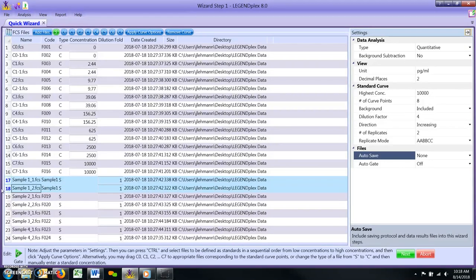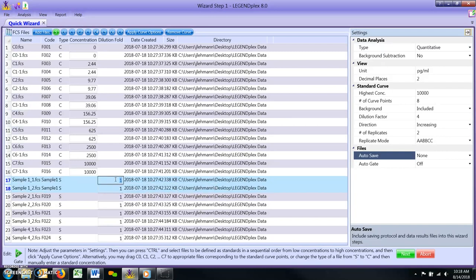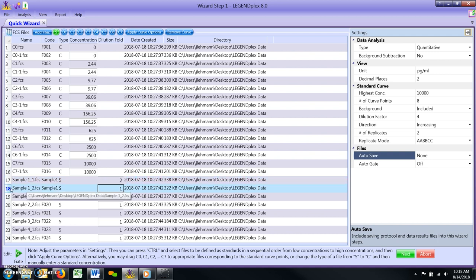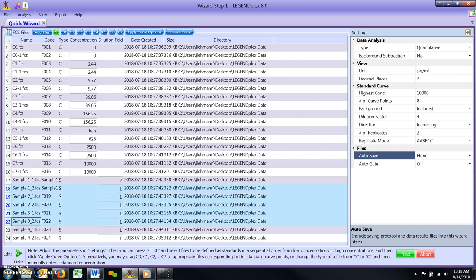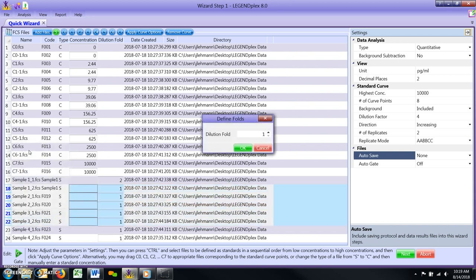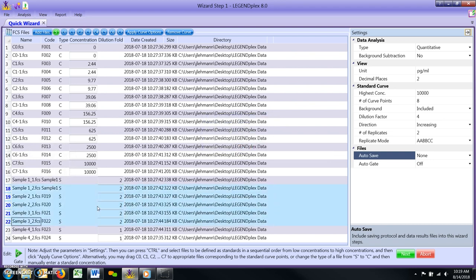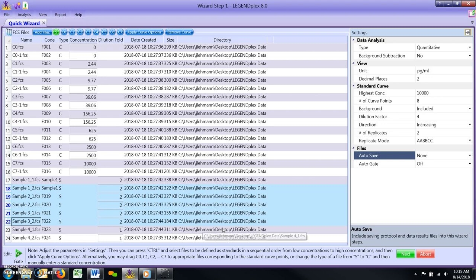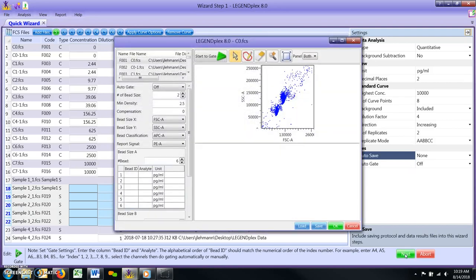Defining Dilutions in Unknown Samples. Define any dilutions made to unknown samples by using one of the following methods. Manually define the dilution factor for a particular FCS file by typing the value into the dilution fold column of the Quick Wizard File List. If multiple unknown samples share the same dilution factor, select the relevant FCS files and then right-click and select Dilution Fold. Enter the dilution factor in the pop-up window and click OK. The software will then apply this value to all selected files. Once finished, click the green Next button at the bottom right of the software window to proceed to the gating portion of the LegendPlex data analysis software.